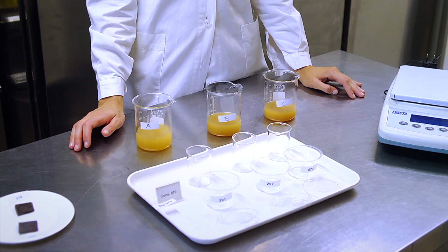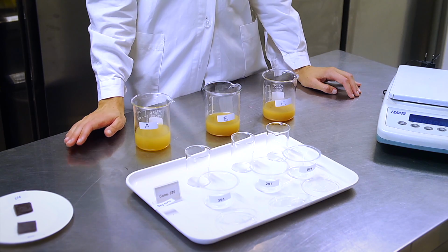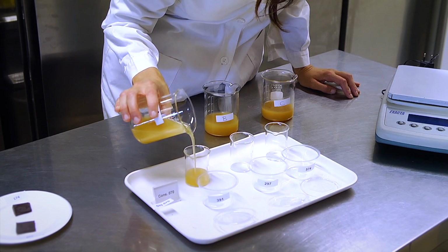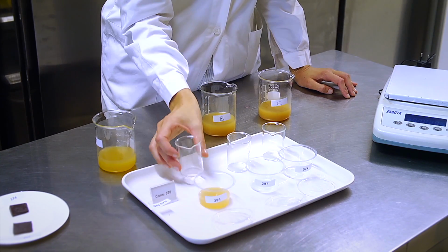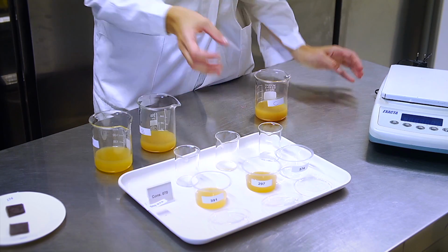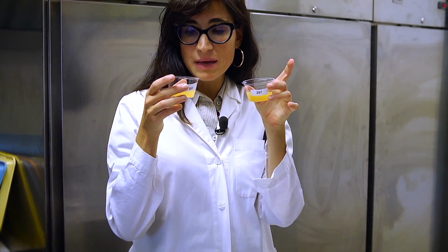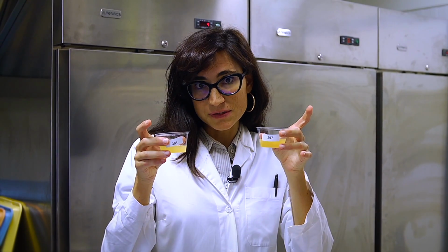As usual, it is important to standardize the serving conditions. What does it mean? It means that the amount of served sample must be the same. For example, let's pour 25 ml for each sample. What happens if the amount served is not the same? It means that if I do not measure, the final amount would be different, and so the overall perception of intensity may be diverse. So the overall amount of smell may be diverse. It's what I call intensity stimulus error.